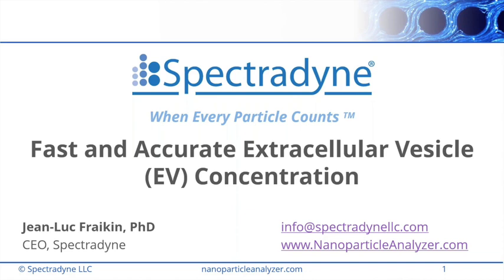Great, thank you. There's another question, which is how to control for swarm detection if many small particles are around. Do you need dilutions? And perhaps Jean-Luc, you want to take this and address it? Sure. So when you're operating our instrument, the raw data is displayed on the screen and updated every few seconds. And it's pretty clear in the raw data whether the sample concentration is too high or not. And so you can inspect that, and if it's too high, it's clear because the particle events become overlapping, and there's a large fraction of events where it's overlapping. And it's just a simple matter of diluting after that.